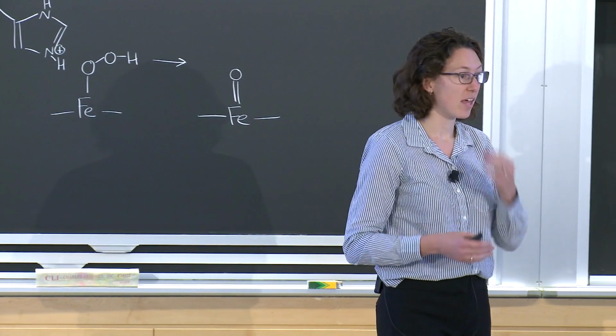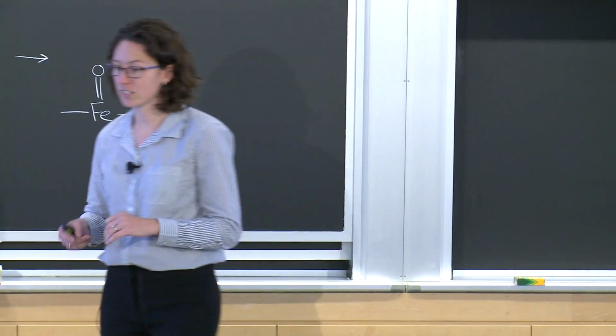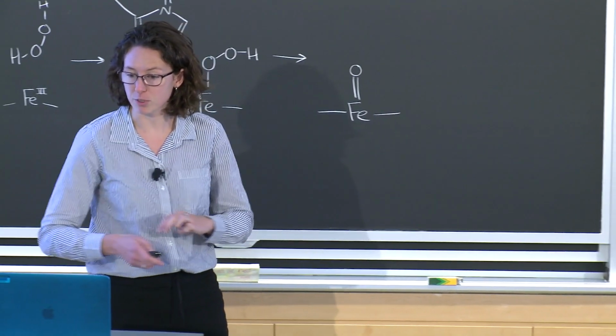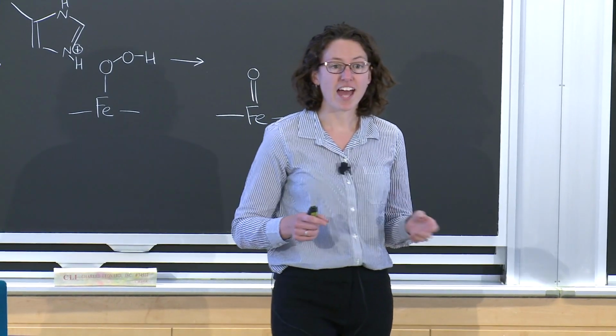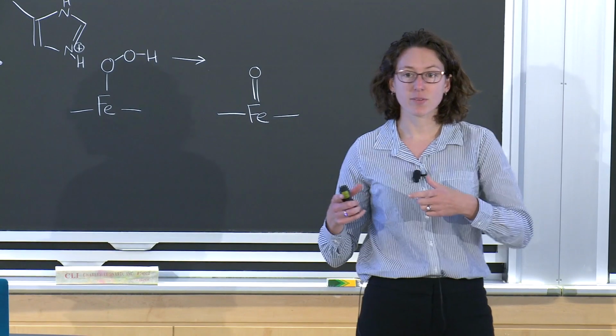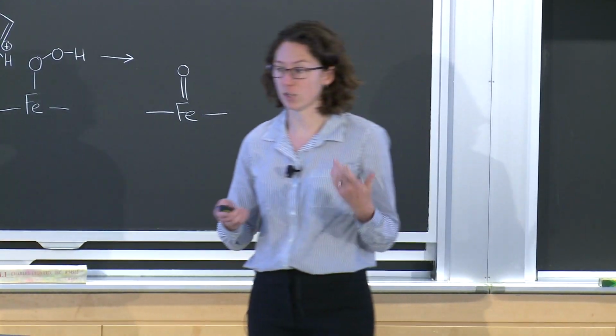For the people who are currently doing the Catalase lab, you've already done part one. For everybody else, you'll get to experience that coming up in the next lab or two. And then in part two of the Catalase lab, we are going to look at quantifying the amount of catalase that we have in a sample, and then looking at the iron centers in the catalase and trying to quantify those as well.